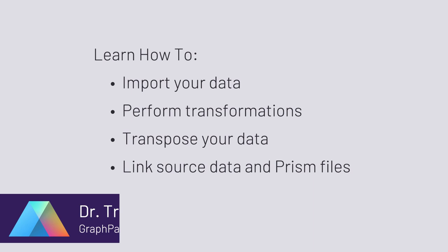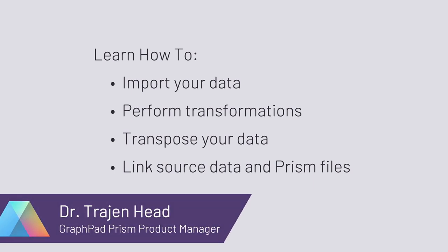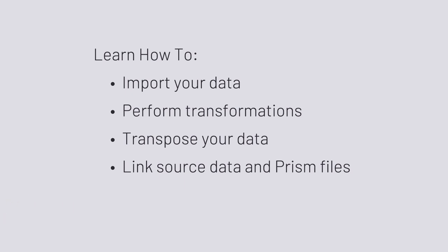In this video, I'm going to focus on some of the ways that you can get your data into a Prism data table from a variety of sources, and a few ways that data can be arranged or rearranged once it's in Prism. I'll also cover some features that Prism provides designed to keep your source data and the values in Prism's data tables connected in a variety of different ways, namely using the concepts of data linking and data embedding.